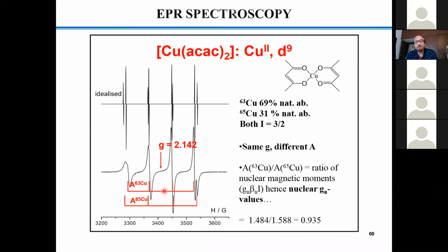Now, if you carefully look at these 4 lines, then at the 2 extreme lines, you will be getting a kind of folded line. That means there are 2 lines which are coupled together. Here it is rather clearer, right? Normally we don't care, it doesn't matter.